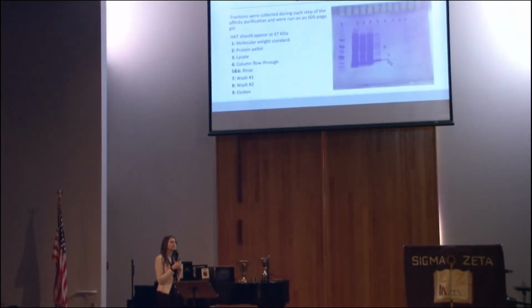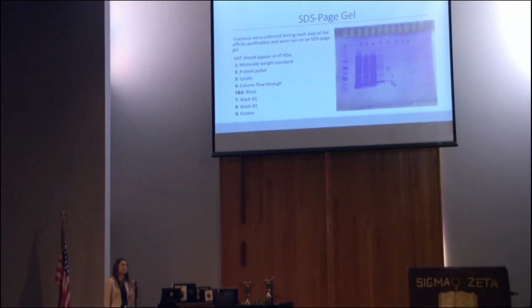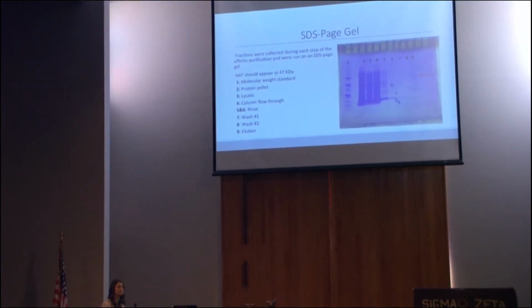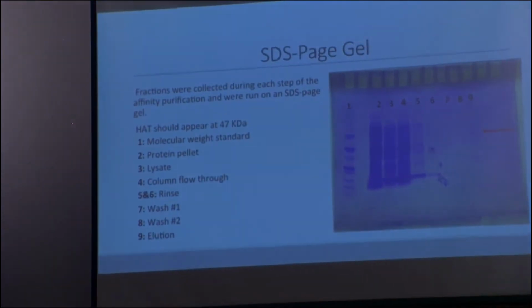Yeah, what's the driving force for the formation of the crystals here? A lot of scientists show crystal aggregates, things like the introduction of ionic solvent. So what's driving the formation of the crystals?